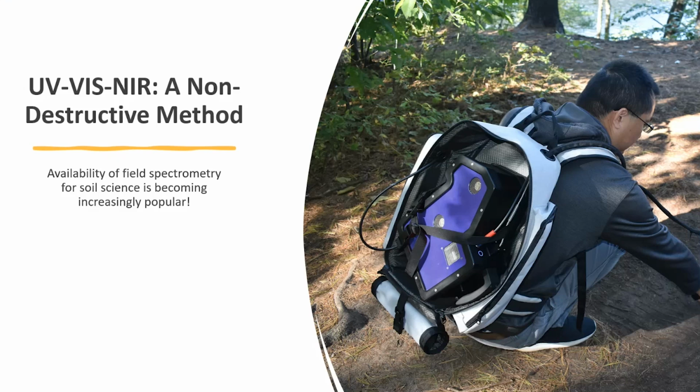With each scan, these typically take under 10 seconds per scan, and these can be averaging 30 to 40 averaging time. So you can collect large sample sizes in a short amount of time in the field.